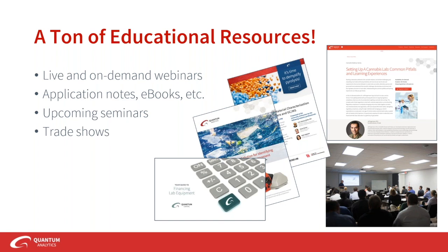This person who asked the question must have been shopping around for an instrument. The main thing is there are some WDXRF systems out there that are a little bit less expensive than others. So even if you just look at WDXRF systems, they can range quite a bit in pricing. Again, it comes down to the number of crystals you incorporate, the number of collimators, and even the protocols or programs that you put onto the instrument.